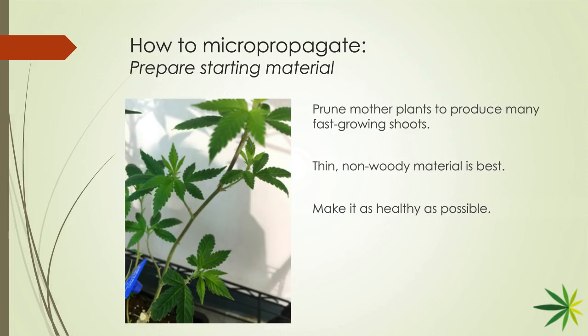All right? Sure. Real quick, I want to answer this question as we're getting to the storage part. Absolutely. Maybe a little premature, but I want to get this out of the way, as one of our listeners has had this up for a few minutes. His question is: is PTC a better storage method than seeds for long-term storage if the cultures are kept in a controlled environment?